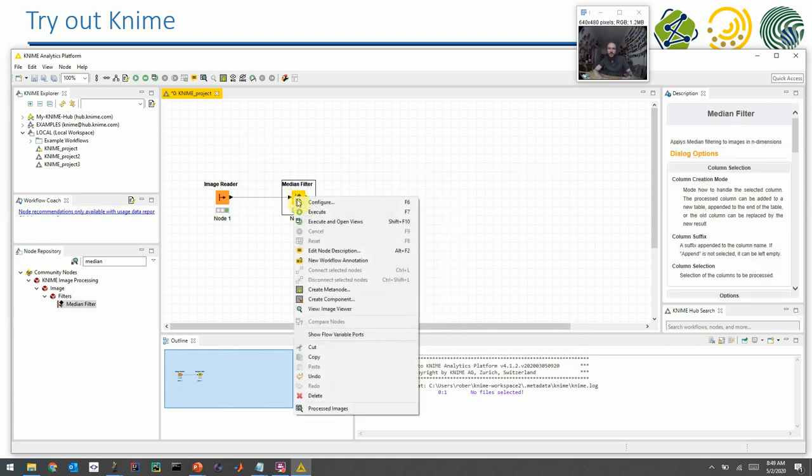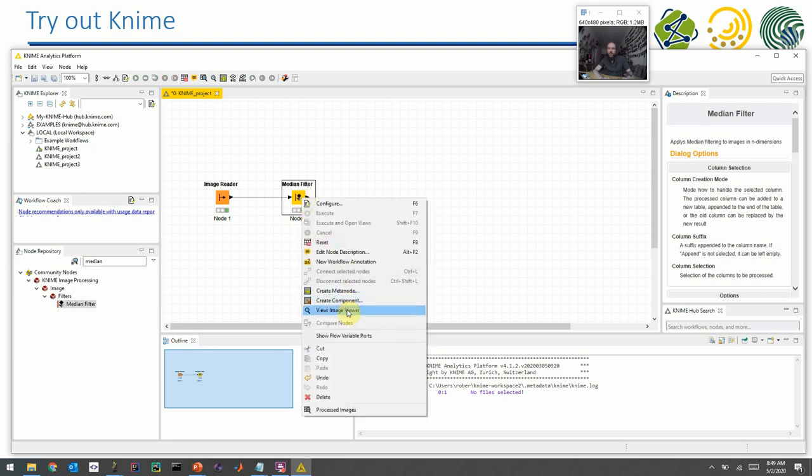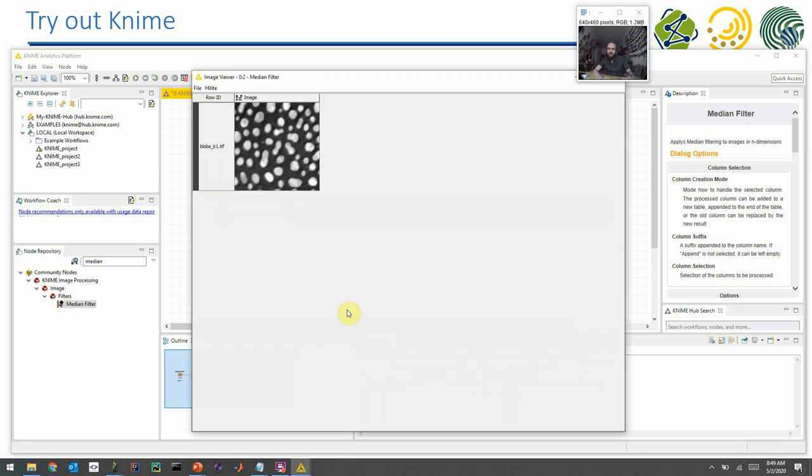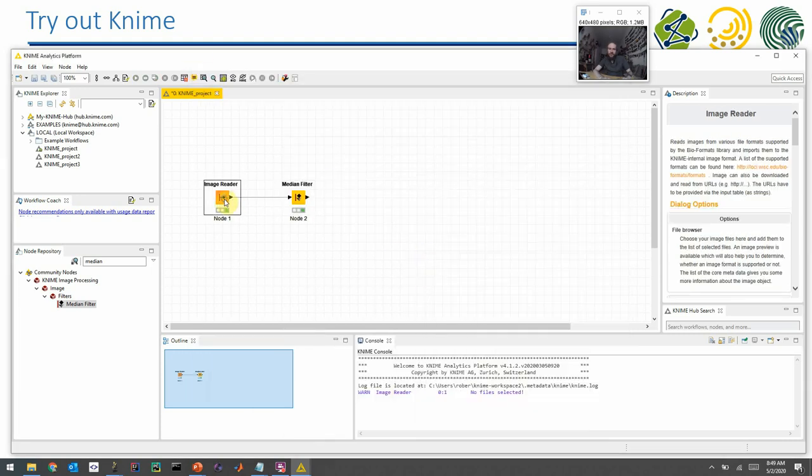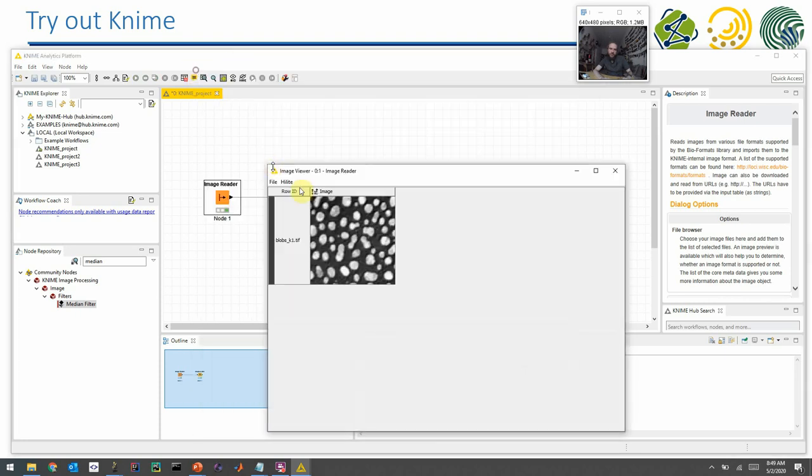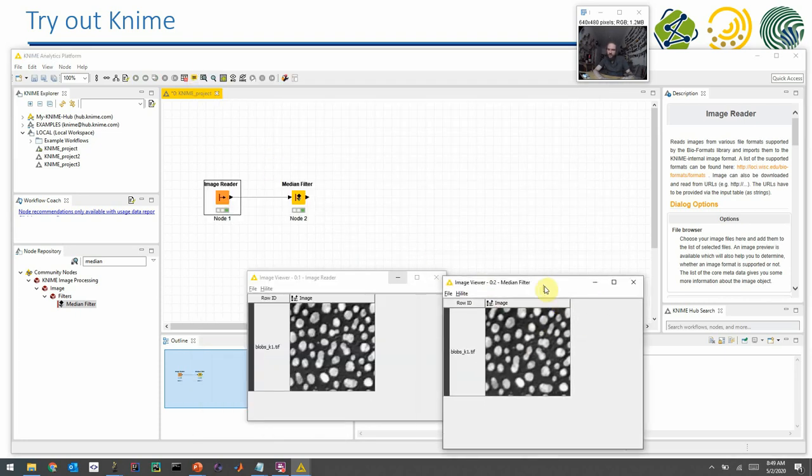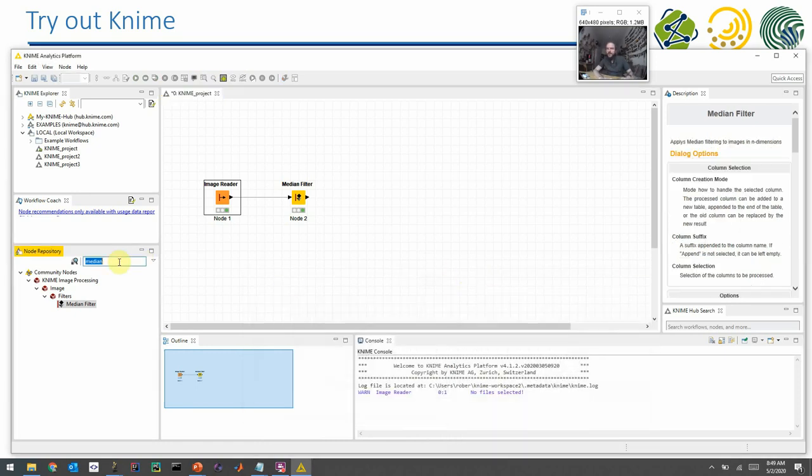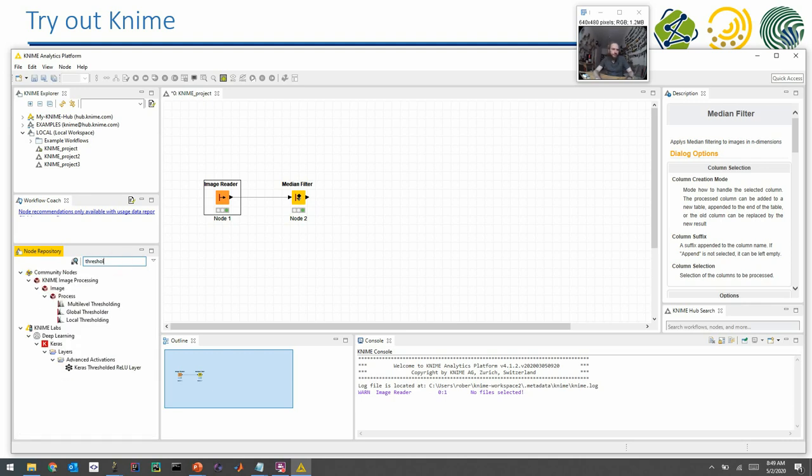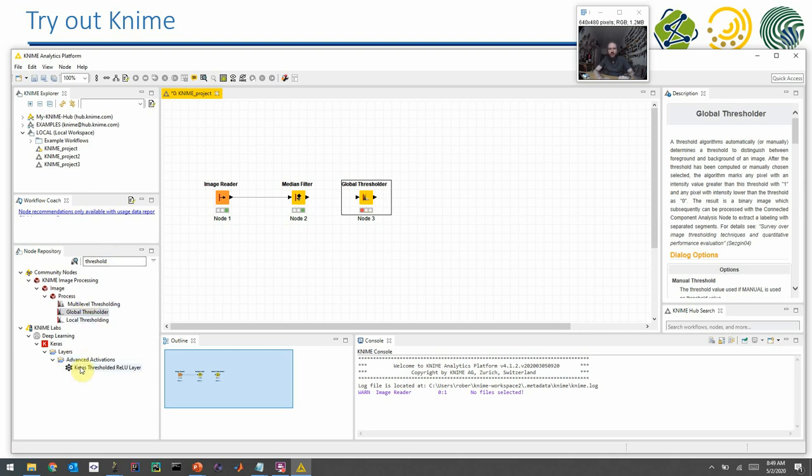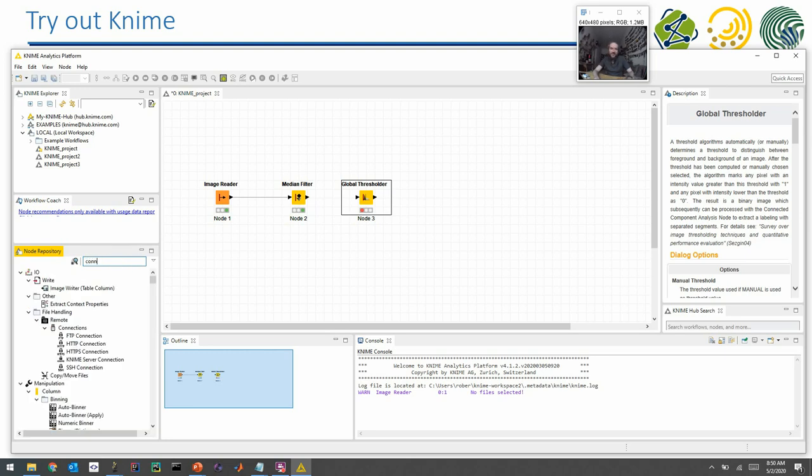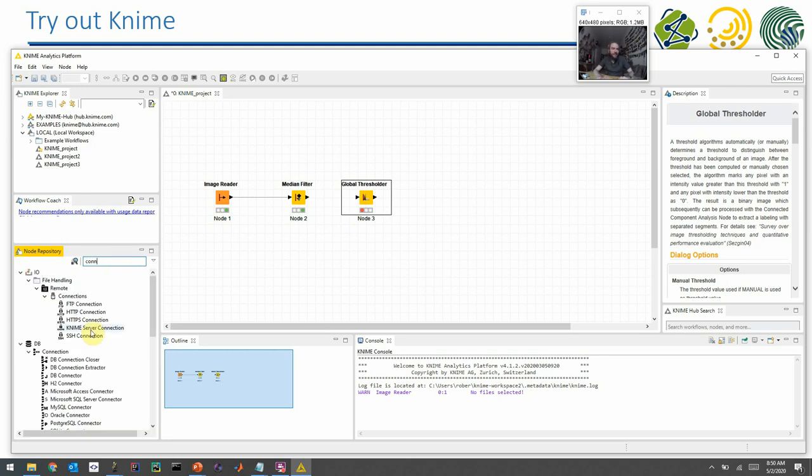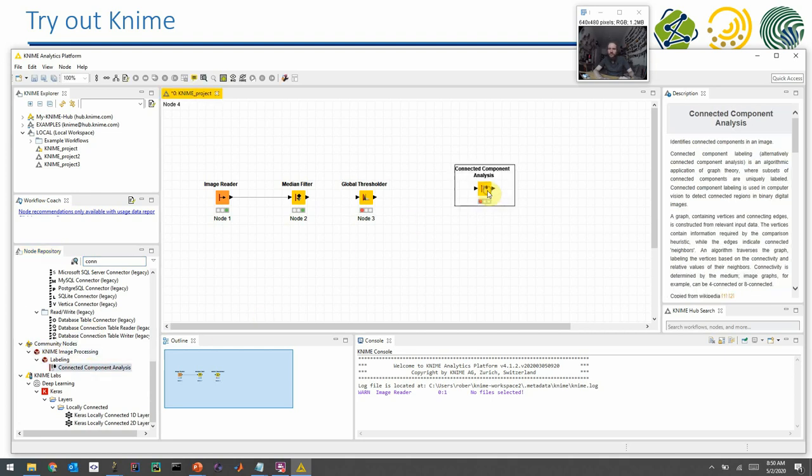You can look at results of nodes by opening the viewer. So I see here the image viewer of the median filter. So after the median filter, thresholding is the next step. I don't want to apply a local threshold, but I just want to have a binary decision. So that's the global threshold. What's the next step afterwards? Connected components analysis. And you see here many things with connect. And in the community nodes, in KNIME image processing, there is connected components analysis.